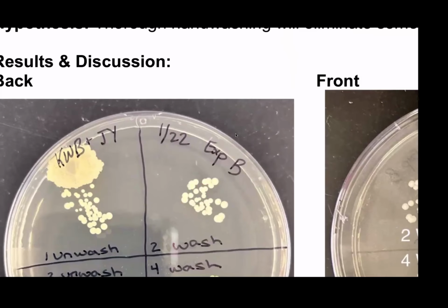Do you guys know why we are seeing bacteria on our hand even after washing the hands? What do you think? What happened? That the soap didn't work, or what could be the reason? Maybe certain areas, or like you just didn't wash your hands properly. Okay. But it's really amazing, right? It's strange. It shows you how strong bacteria can be, and even if you wash your hands, it's still going to be there. Anybody else, guys? What do you think about this experiment?